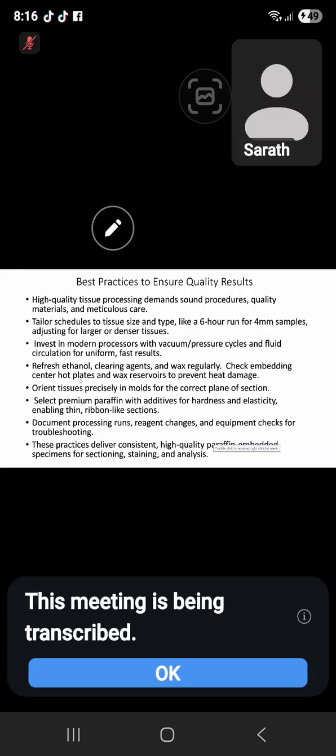Check the embedding center, hot plates, and wax reservoir to prevent heat damage. The temperature of the embedding center and wax temperature should be checked. For the wax reservoir, you have to check the temperature. Otherwise, if the temperature is very high, tissues become barbecued, and finally they will become brittle. So always you have to control the temperature of the embedding center.